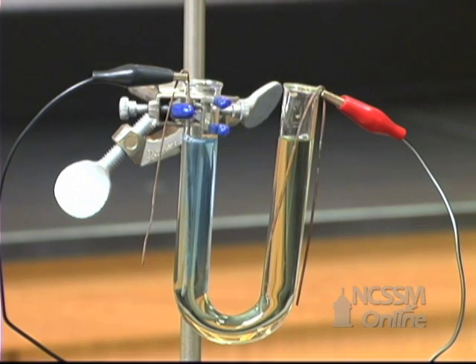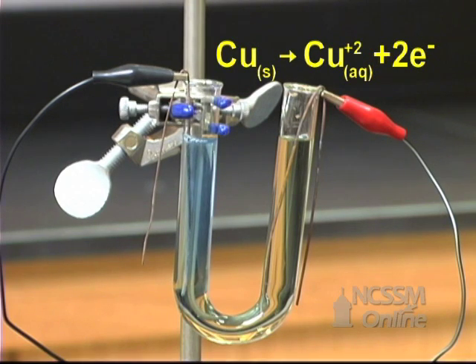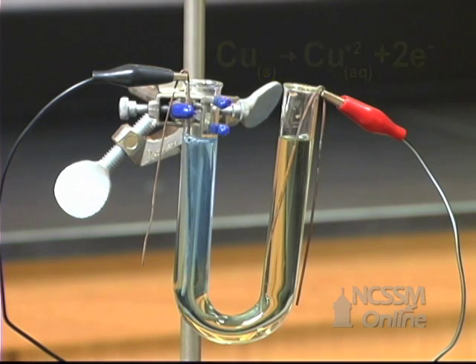On the anode, the copper metal electrode itself is more easily oxidized than the water. The solution stays essentially the same color and no gas is evolved. Over a period of time, the solution would turn blue due to the formation of copper ion.